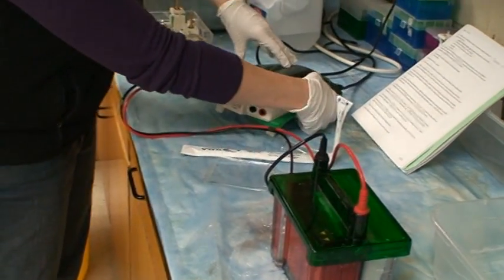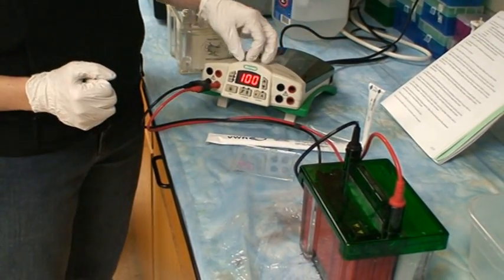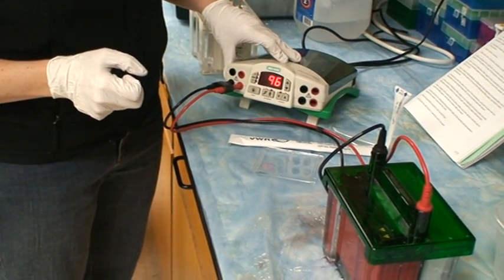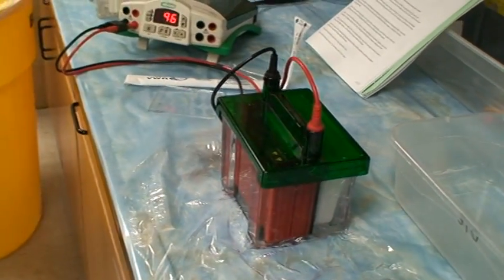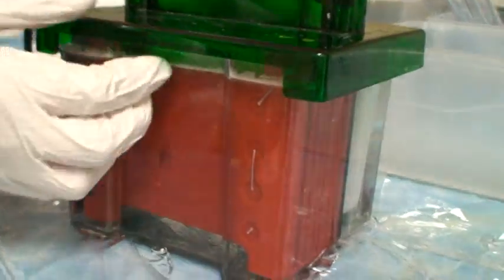So turn your power source back on. Hit volts. Make sure it's set to 100. And hit the little running man. And then you want to look at your transfer to see if you can see any bubbles forming.